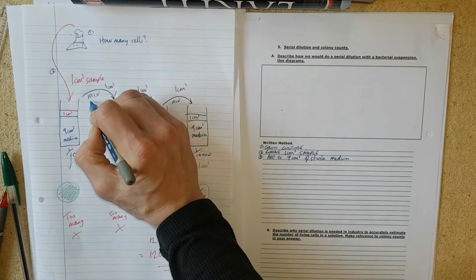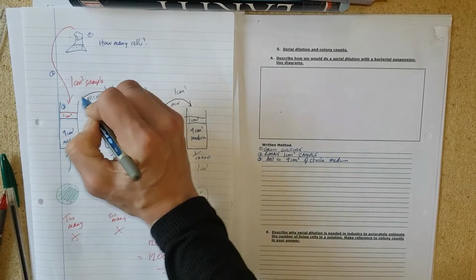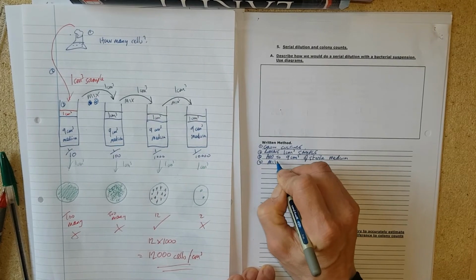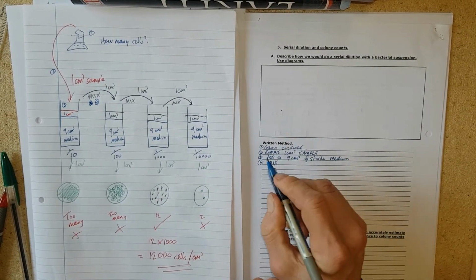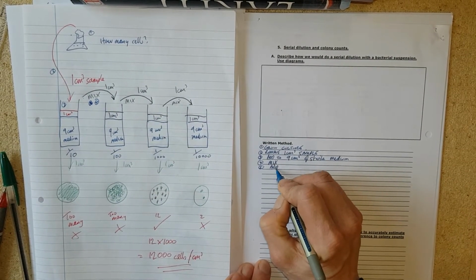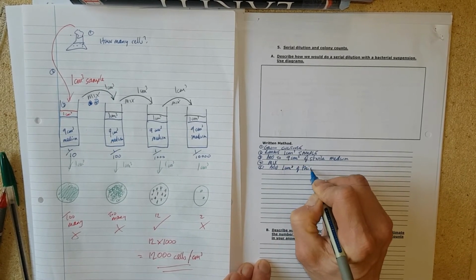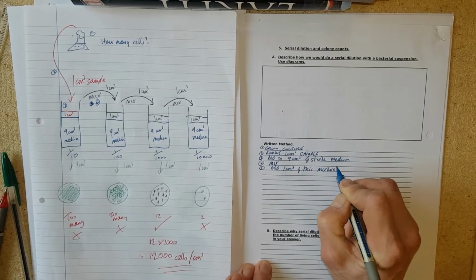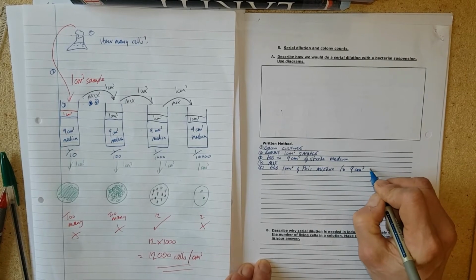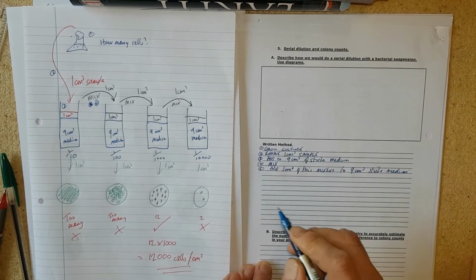Then we need to, so that was 3 there, so this one will be 4, so 4 mix. Number 5 is add 1 cm cubed of this mixture to a new tube, which is 9 cm cubed sterile medium.